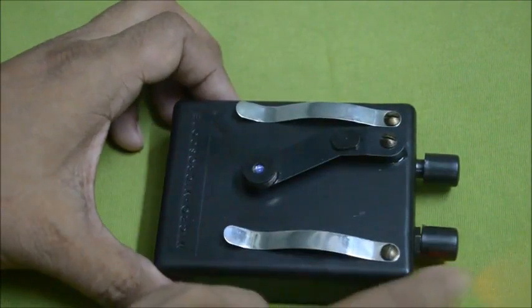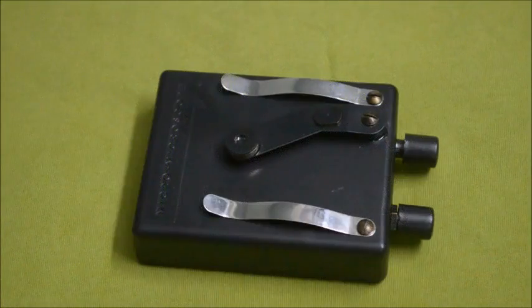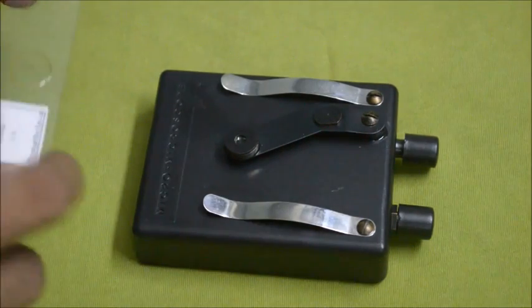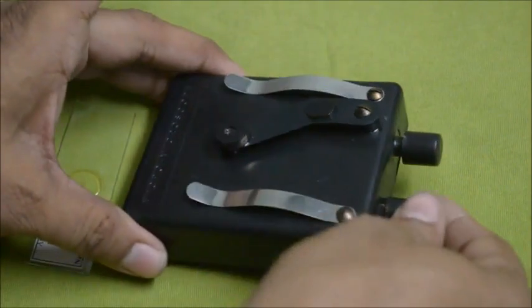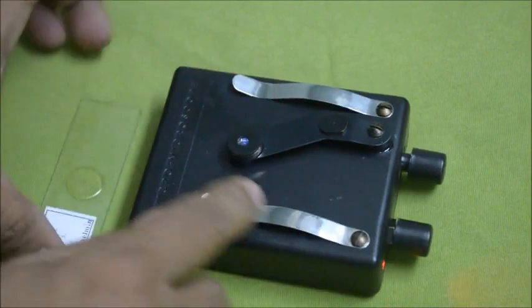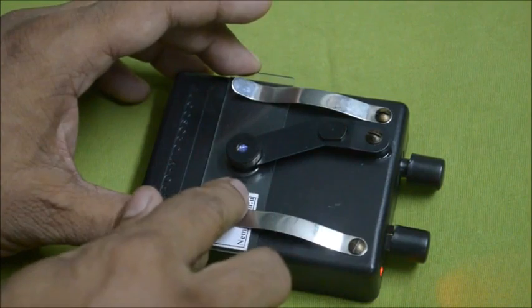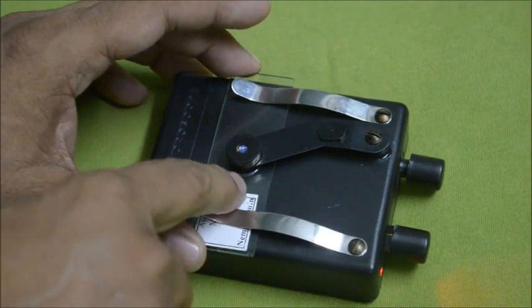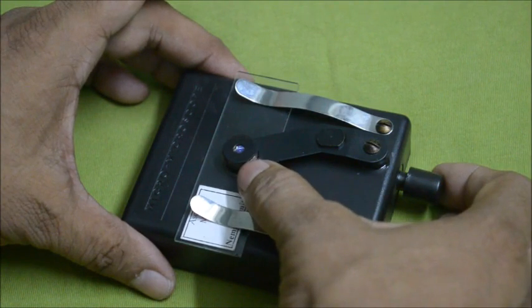Now I will demonstrate how to use this micro microscope — it's very easy to use. First, you select the slide; the specimen is here. Switch it on — as soon as you switch it on, the red LED will glow. Then insert the slide by pushing it so that the specimen is just below the viewpoint.